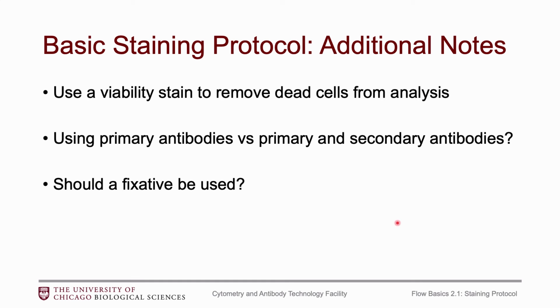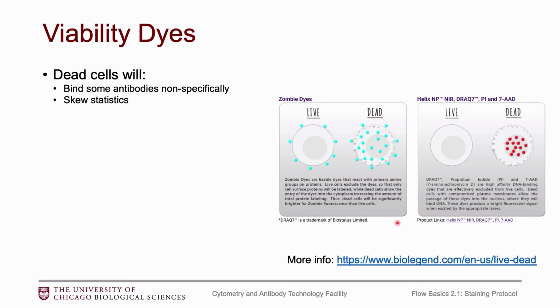And last, I just have a couple additional notes. I want to talk about viability stains. Sometimes I get questions if people are familiar with microscopy, where they tend to use primary and secondary antibodies. I'll touch on that subject, and then also fixatives.